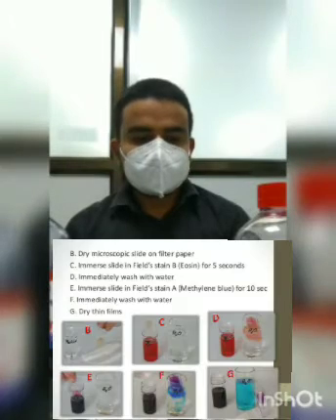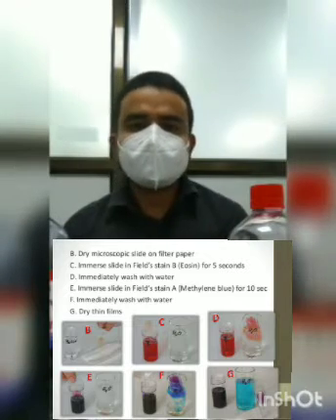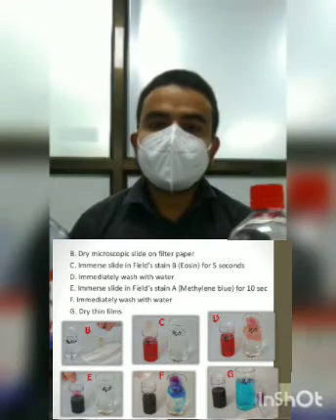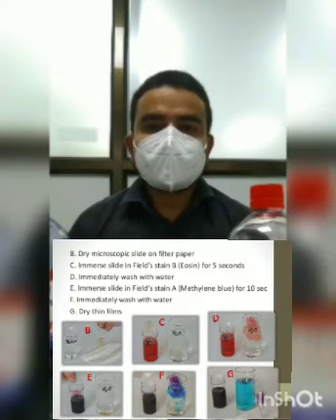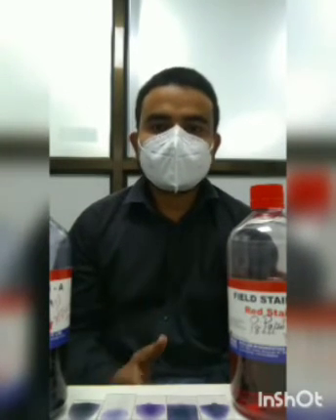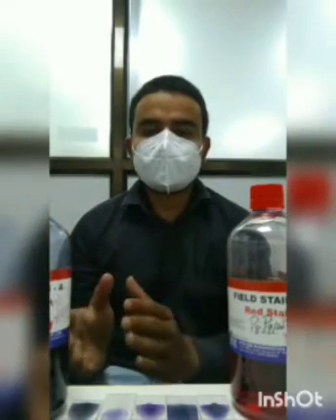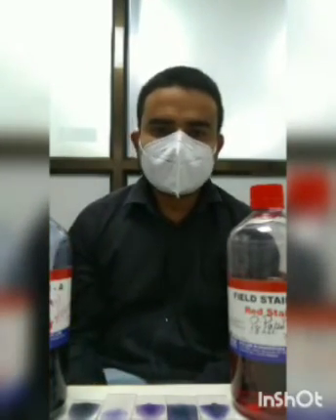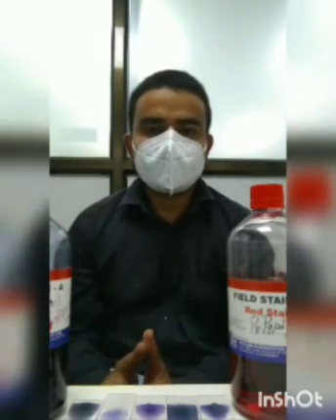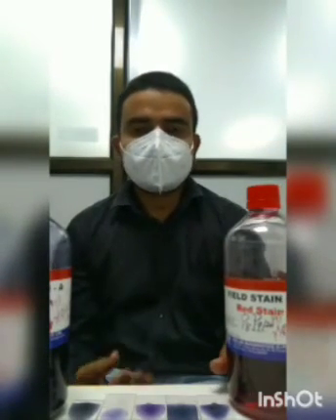Okay, so the procedure is very simple. Basically the staining procedure for each and every stain has to be calibrated according to the individual laboratory environment. There is not one specific method as far as the timing of the staining, various steps of the stainings are concerned. Those have to be calibrated according to individual laboratory environment. But I'll tell you the basic concept.